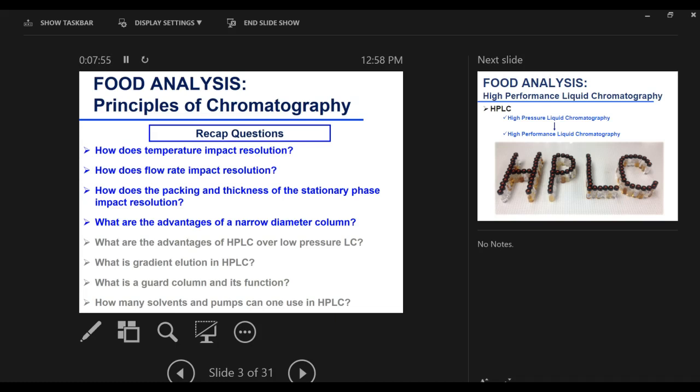on the column. So you only have a little bit of room for your sample to go in, not a lot. So not a lot of diffusion, not a lot of surface. Whereas here, your stationary phase is all packed in the column. So you have pores, and you have your packing material, and then you have the pores within each packing material. So there is a high chance of going in and getting diffused in your stationary phase.